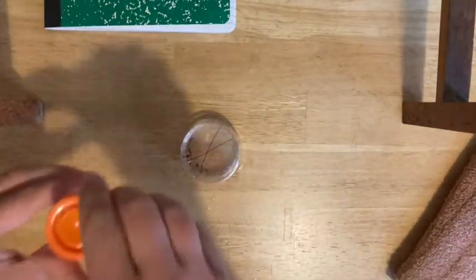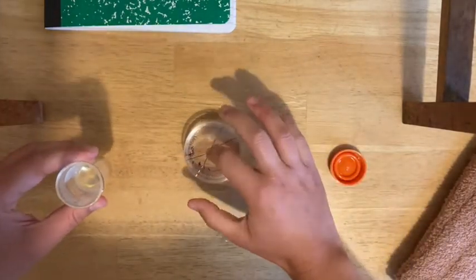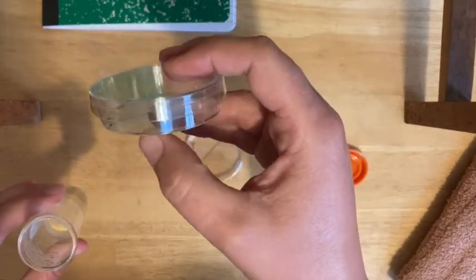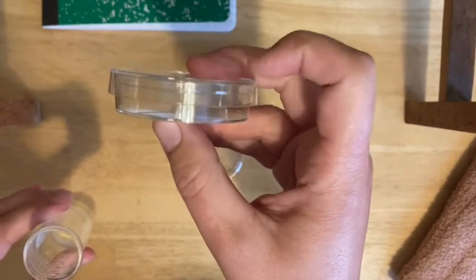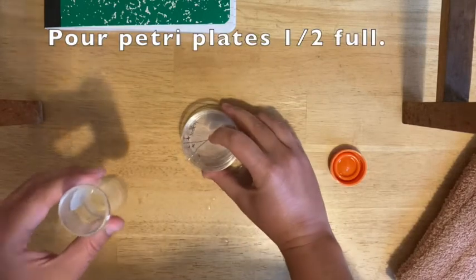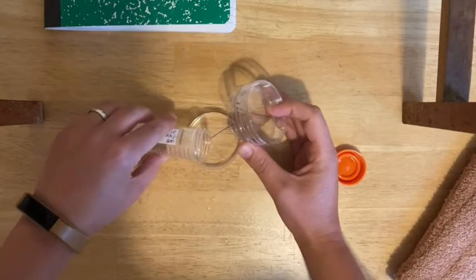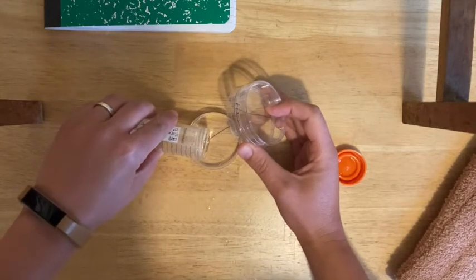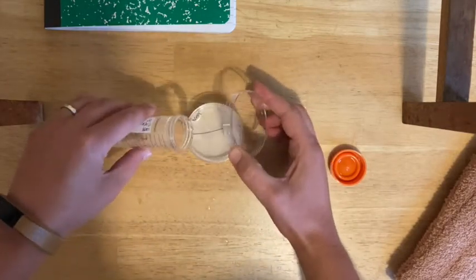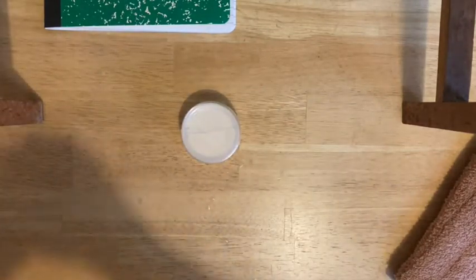Clear everything else out and give yourself a clean space to work. Pour just enough to cover the bottom of the plate. You may want to use the hot hands since it may still be kind of hot. When you look at a petri plate, the smaller circle is the bottom where you pour the agar, and the bigger circle is the lid — don't leave these open, and don't touch the inside. Crack open the bottom one and pour just enough to cover the bottom of the plate, then cover it up right away. Do the same for the next one. You may see some condensation forming — don't worry about that, it's fine.